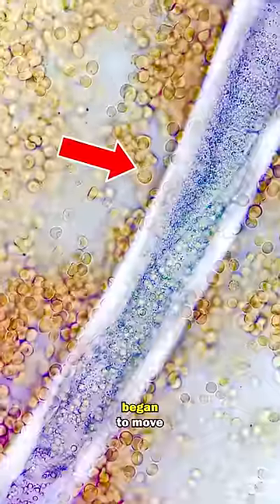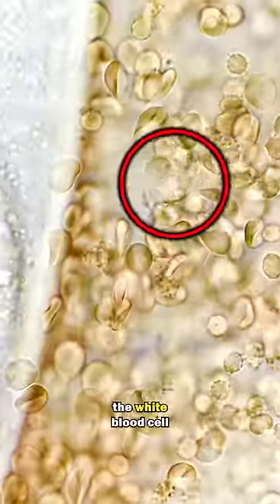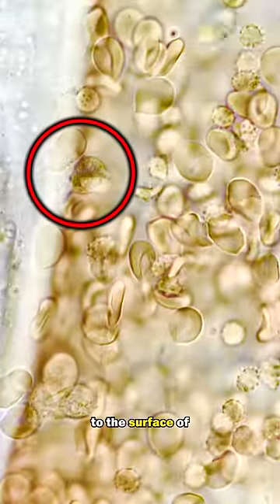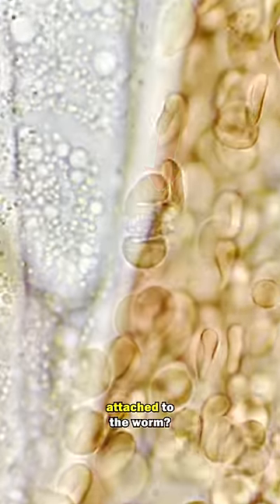A single white blood cell began to move towards the worm. The white blood cell circled here is moving towards the worm. It then attaches to the surface of the worm. Watch this again. Can you see the white blood cell attached to the worm?